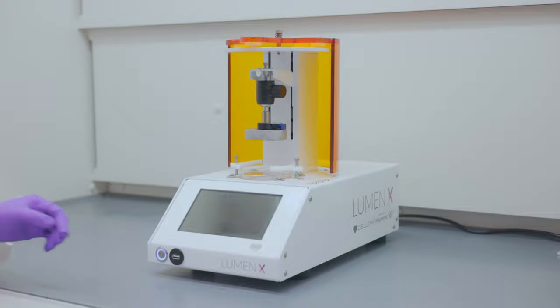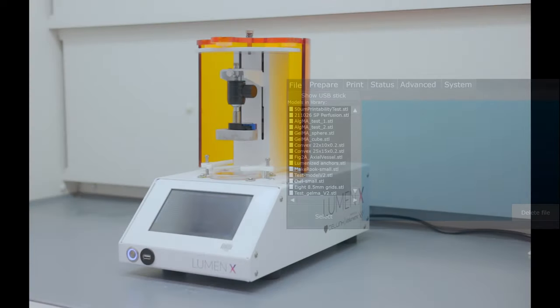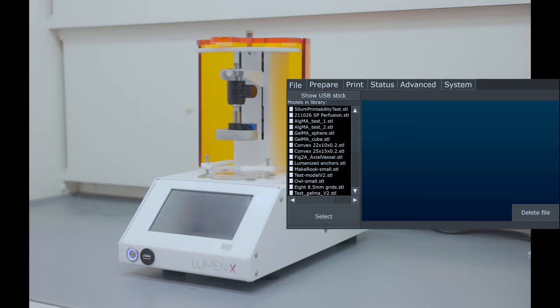Power on the printer by toggling the power switch twice. Once the printer boots up, we can see options on the touchscreen. We have different menus on the top and options here. First, we start with the file menu and proceed to the menus on the right.